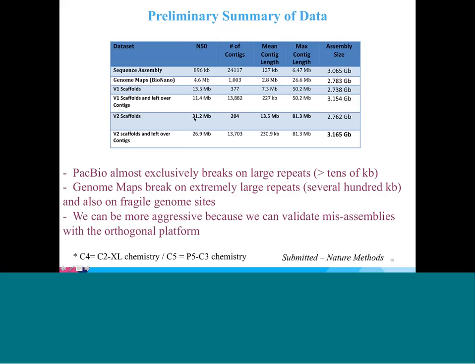So it's different than the full data set size because the scaffold is losing some genomic material. So this is an important thing to point out. The scaffold doesn't completely capture everything in the genome. I'll go back to this later on when I compare to some other assemblies, but this is actually not uncommon with scaffolded assemblies. If you compare it to other high-quality scaffolds, about 91% of the genome is maintained, which is actually pretty good quality. So we're pretty pleased with that.